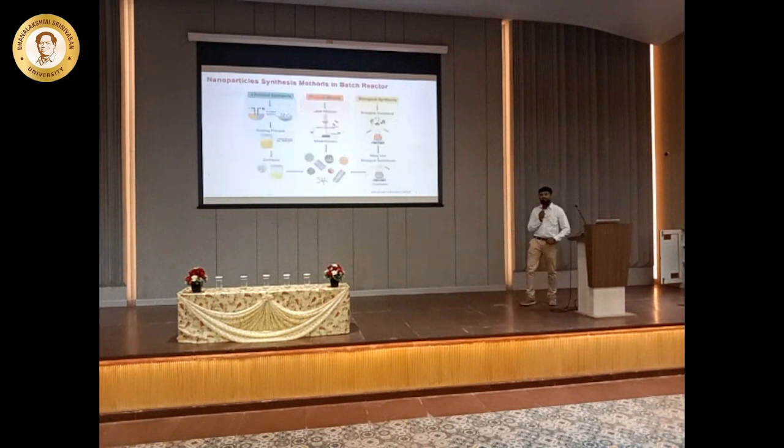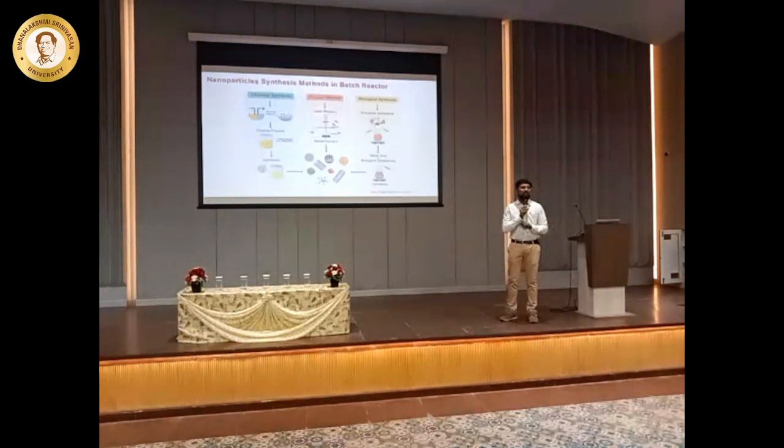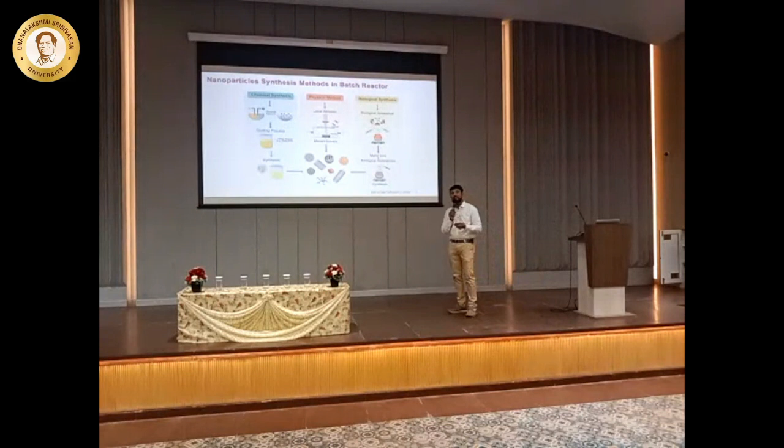So we have different methods of batch reactors. We say chemical synthesis, physical synthesis, and so on. I've worked most on these synthesis protocols because we develop different structures and different nanoparticles that facilitate making unique nanoparticles for certain applications, like say imaging agents, or I want to make it into iron oxide nanoparticles or whatever it is, right?